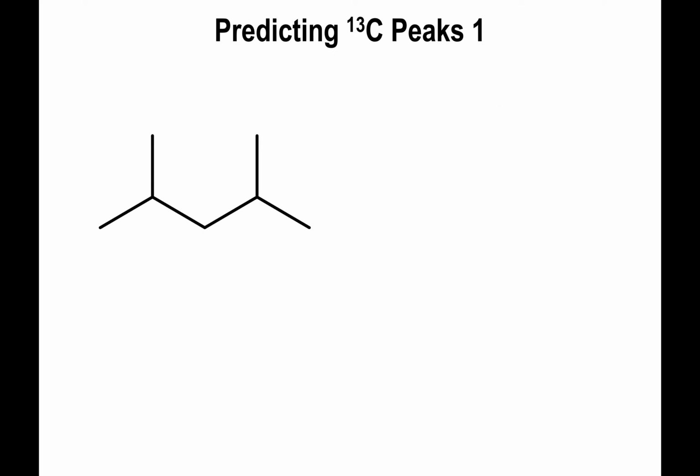All right, now with all that being said, let's actually look at molecules and the spectrum and see how we can determine what corresponds to what. And we go back to this molecule that we talked about before, except that now we're going to be paying attention to carbon exclusively. And just to remind you, we have a mirror plane in the molecule itself, which means that what's to the left of the mirror is identical to what's to the right of the mirror plane. So we're going to have 4 carbons, the ones in red, which are identical to each other. They are equivalent, in other words.